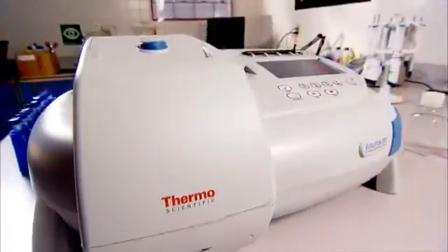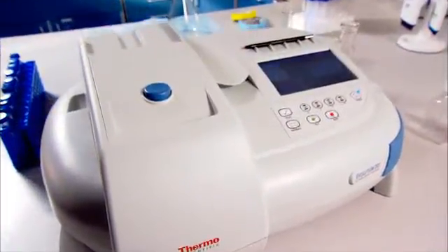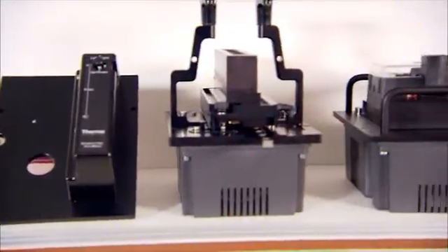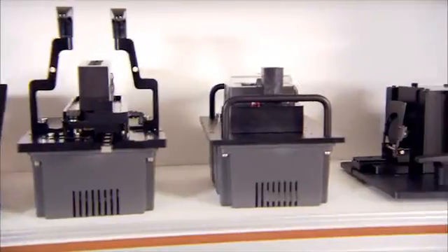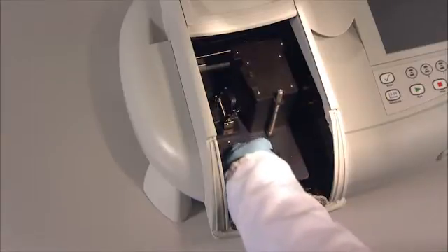In fact, the Evolution 200 Series offers unrivaled features and performance with a large room light-resistant sample compartment to accommodate a full range of accessories and sample types. A removable sample beam detector to utilize specialized accessories.